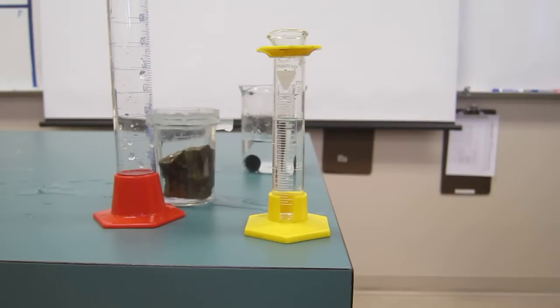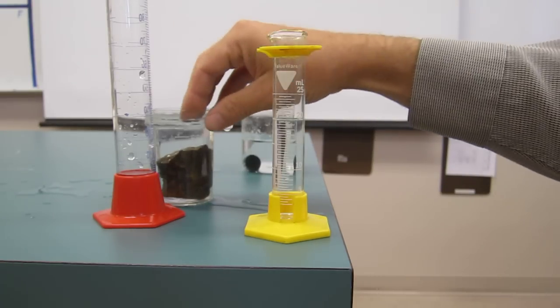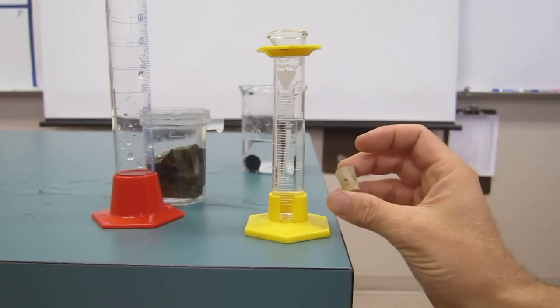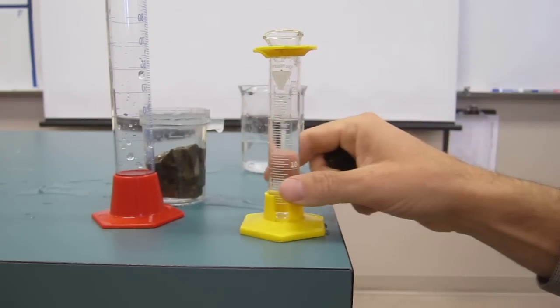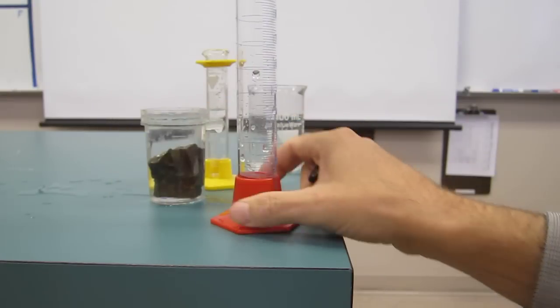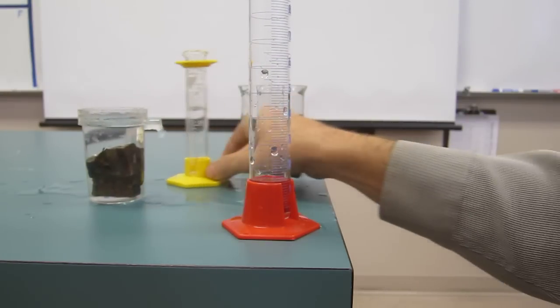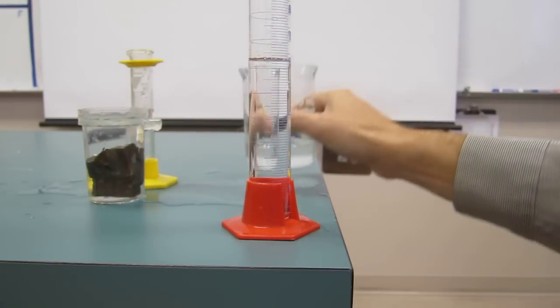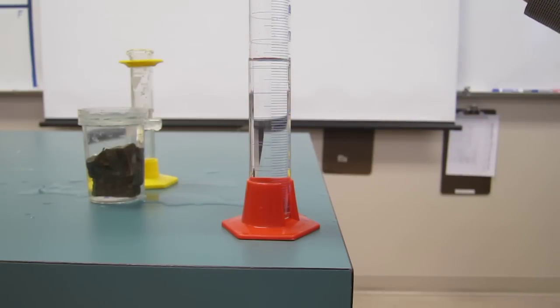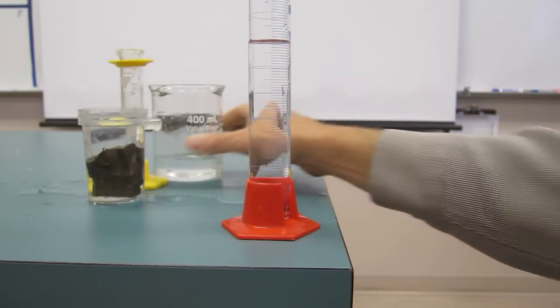And then once you've been asked to do that, I ask you to figure out the volume of a cork. Problem with a cork is that it floats. So students had to problem solve this again. Most of them went for this graduated cylinder, and they filled this up with some water. Going for 70 milliliters there.